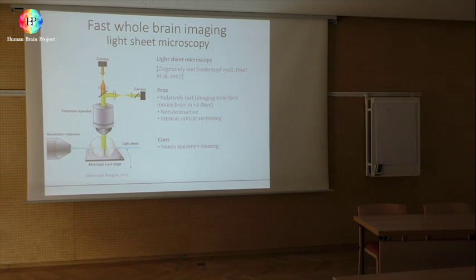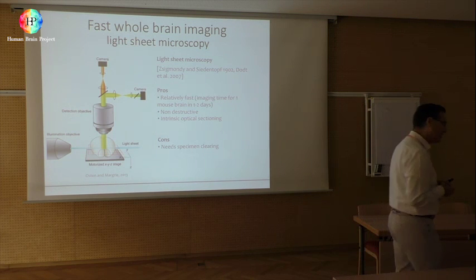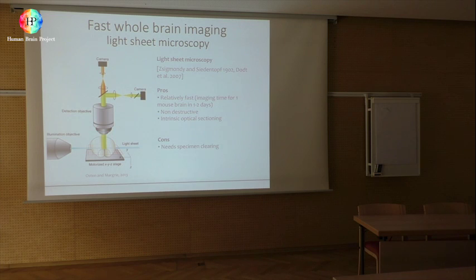Yeah, but when you map the whole brain, via whatever process, afterwards you have the map of the brain. So why is there so much attempt to make a new method to be faster? Even if it takes 1 year, you can map the whole brain in 1 year, and after that maybe you can have the atlas of the brain. This is not true, because there is biological variability.